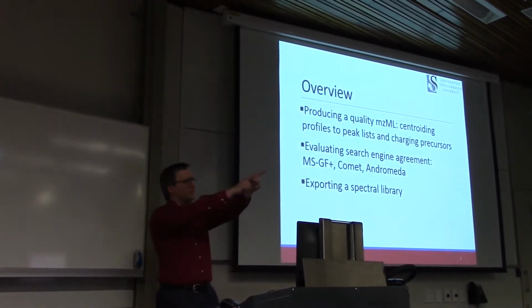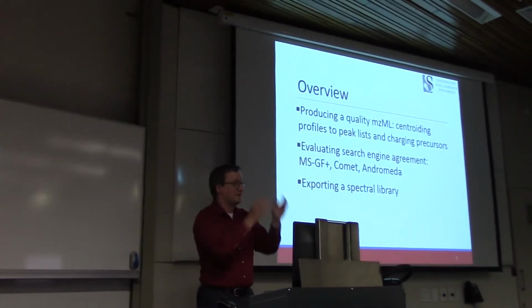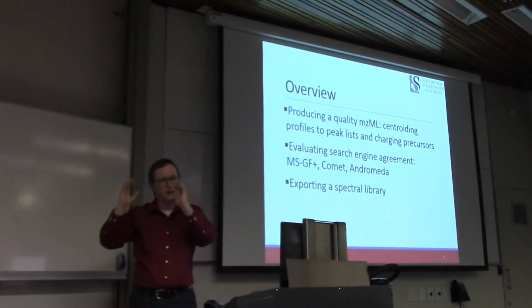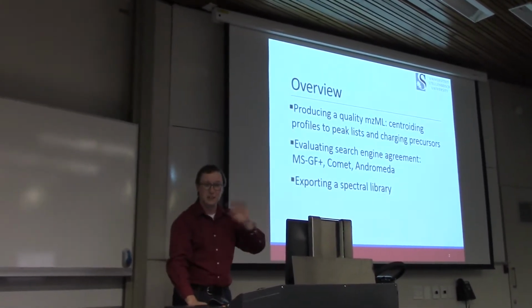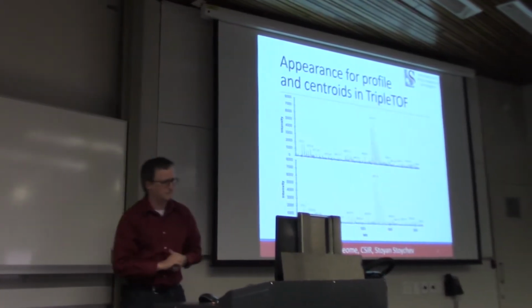to get from me to Bridget. I care a whole lot about the identification problem. Bridget is really helpful in dealing with all these quantitation problems. But at some point, we have to translate our information of what we've identified in the sample to what we're going to quantify in the sample. And that handoff is a little bit complex. So I'm going to try to talk about just some of the broad outlines of that.